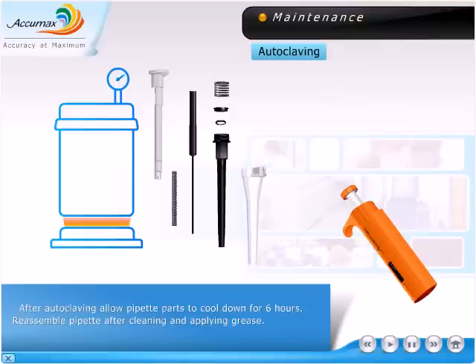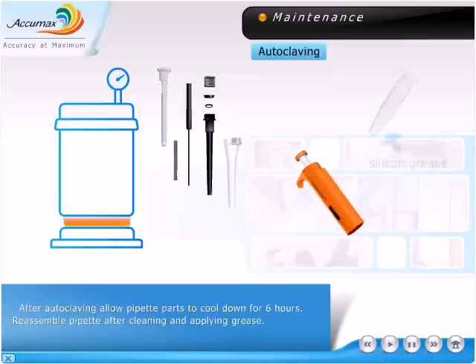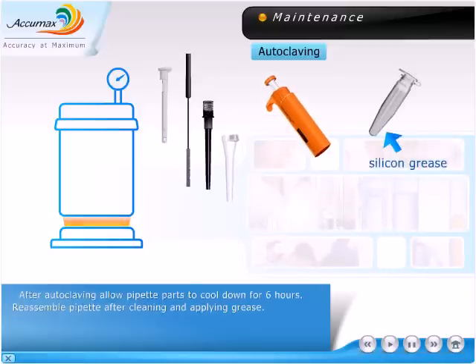After autoclaving, allow the pipette parts to cool down for 6 hours. Reassemble the pipette after cleaning and applying silicone grease.